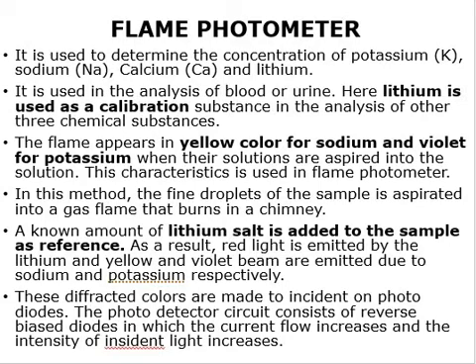That is why we give blood samples and urine samples for the measurement of this content. If any of them is more or less, then that indicates a deficiency of that material. Very important: even though we identify these chemical compositions in our blood, the system has to be calibrated before measuring the samples.